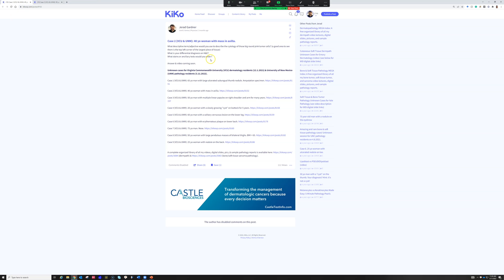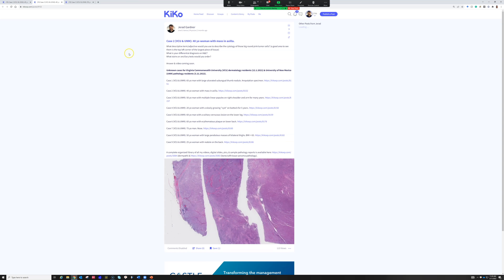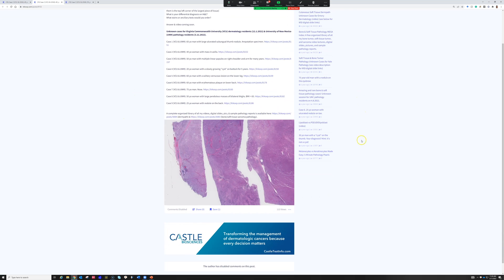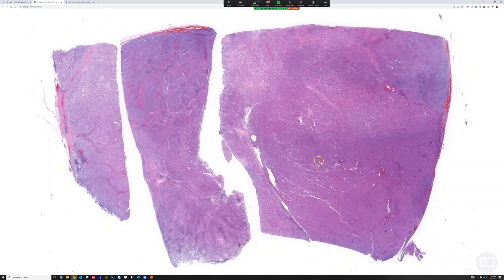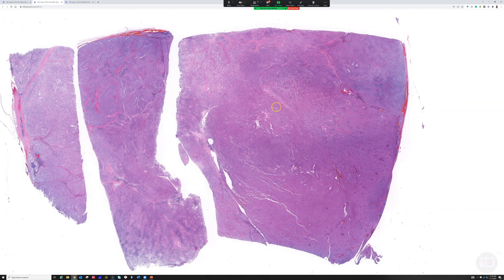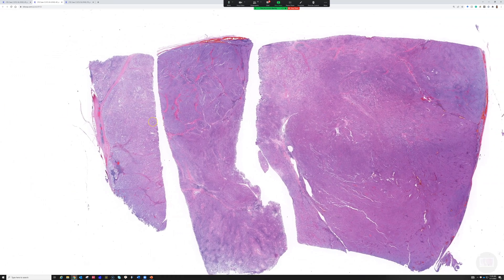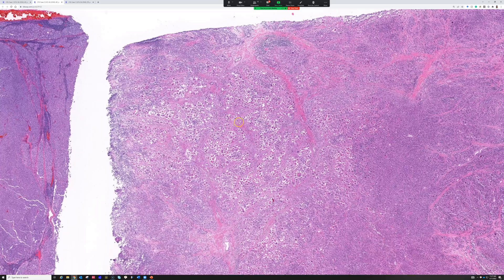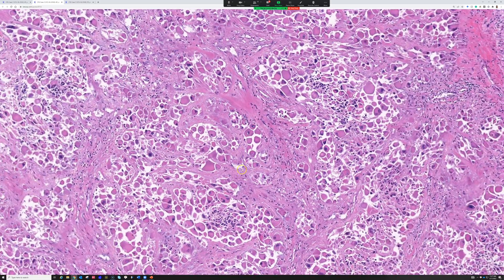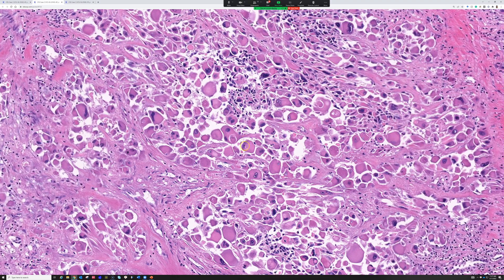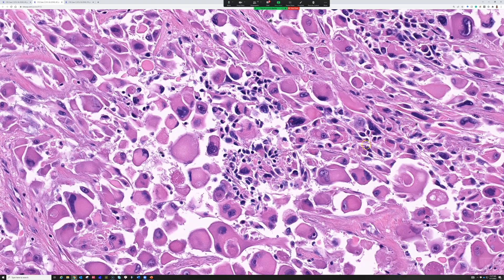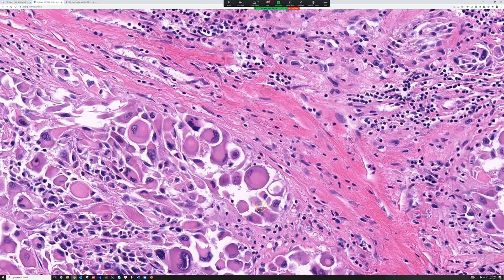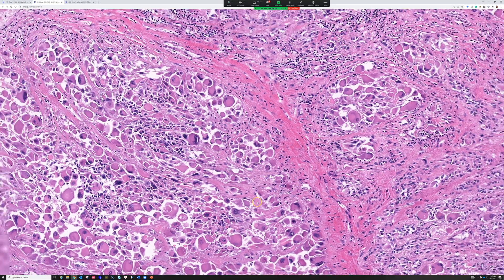Case 2 is a 40-year-old woman with a mass in the axilla. It's a huge slab of tissue here that we're dealing with — there are multiple slabs. These are huge, almost inclusion-like structures, and these are actually massive nucleoli in these tumor cells. We've got large eosinophilic cells with abundant cytoplasm here.